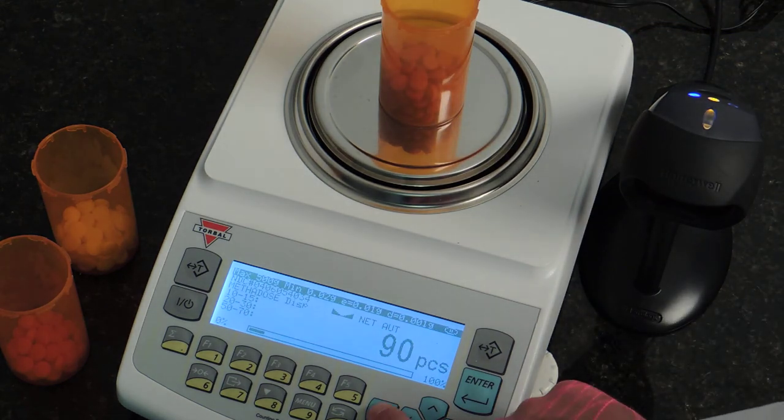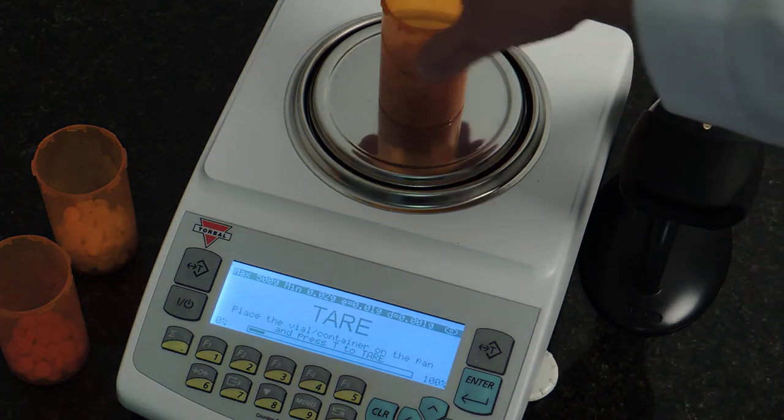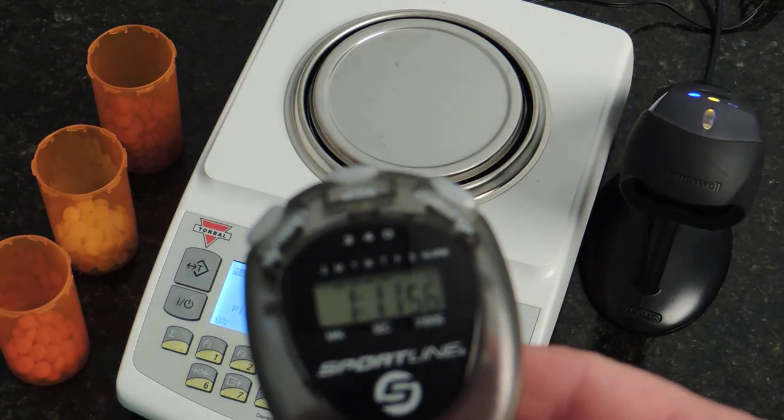So, let's get started. These three transactions were performed in one minute and eleven seconds.